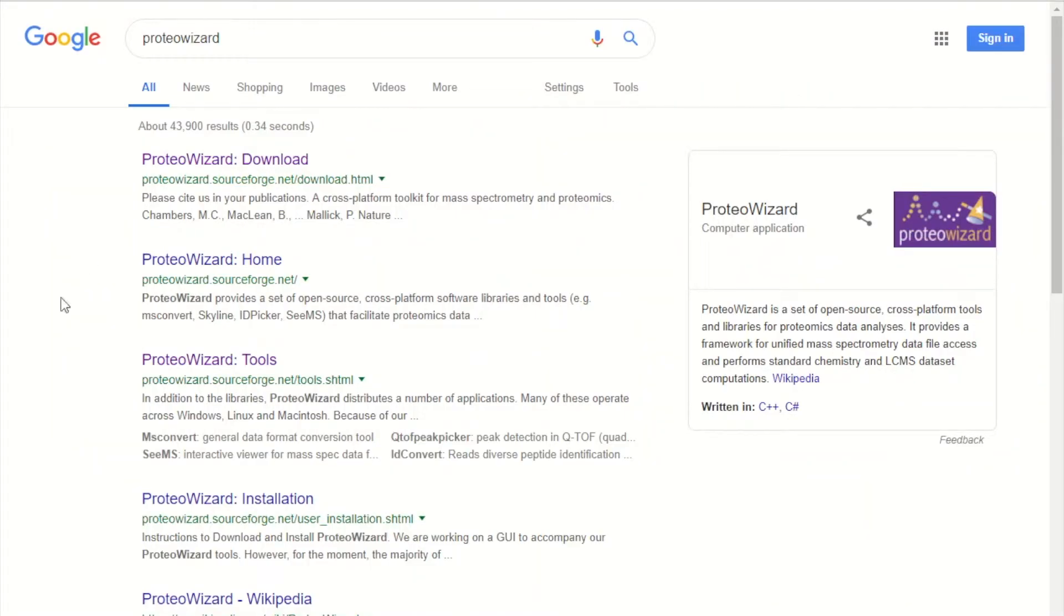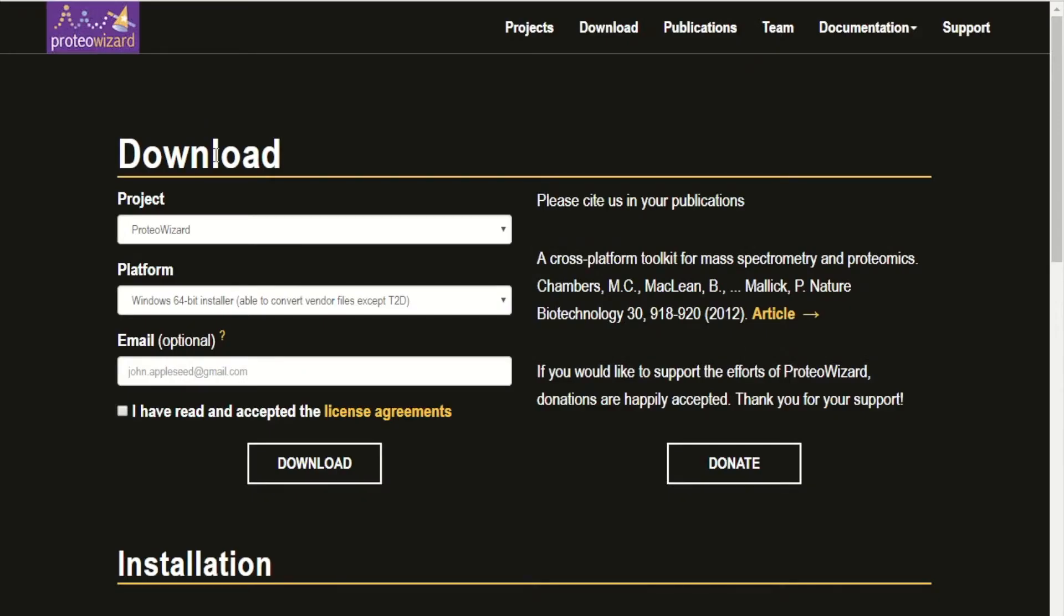First, you want to download ProteoWizard on your computer. You can simply google ProteoWizard, and it's a free software.